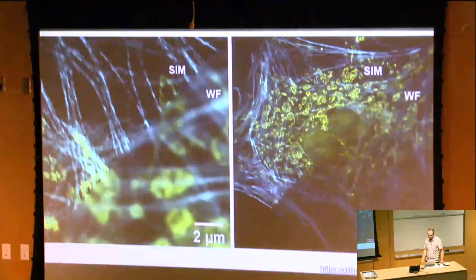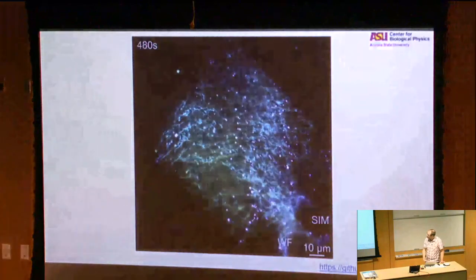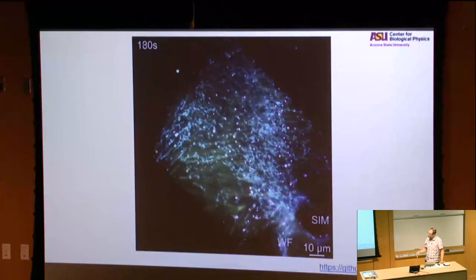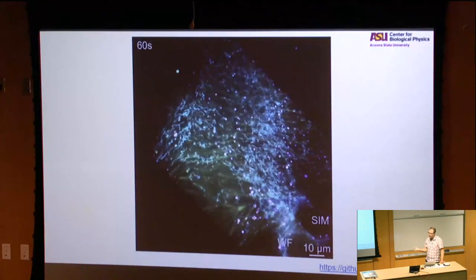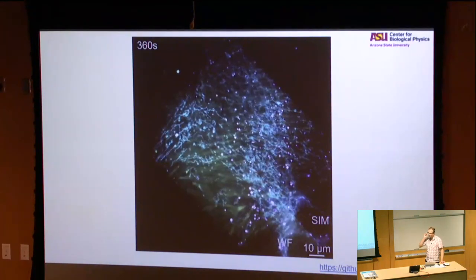But for dynamics, we don't care so much. For this type of work, like the movie here, I would say this is not really that monodisperse for some of these things, right? It's maybe sparse in the sense that it's not completely packed, but there's still some frequency information.